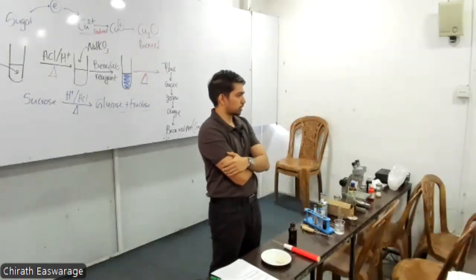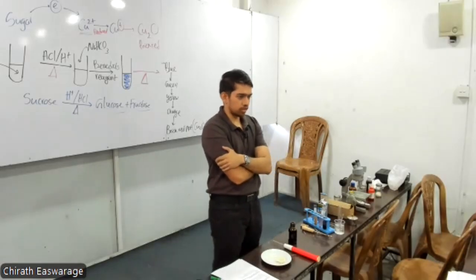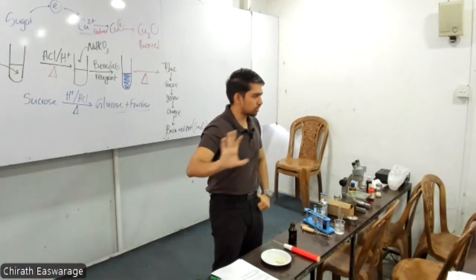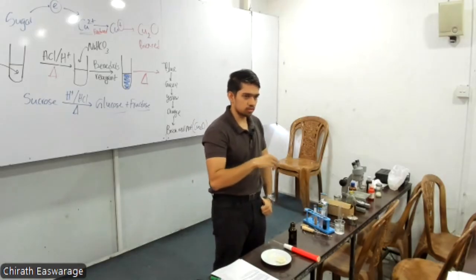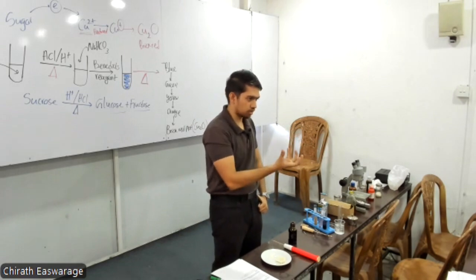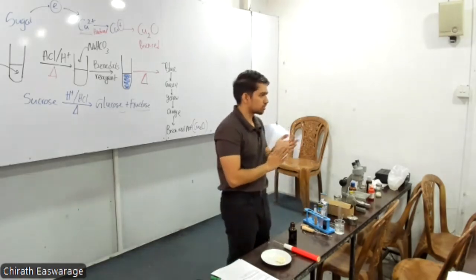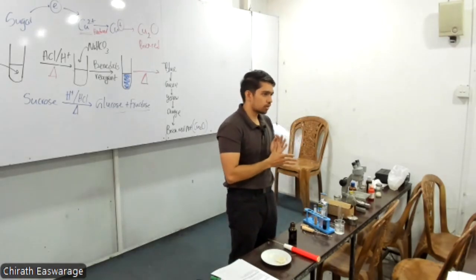Usually enzymes are very heat sensitive, right? We can't heat them. If they get converted back to the primary structure level, they get broken down. We can't usually reverse it back, right? We can't get the liquid egg white back. It has become solid, right? So denaturation is usually irreversible. So we are going to do that experiment again with iodine, right?